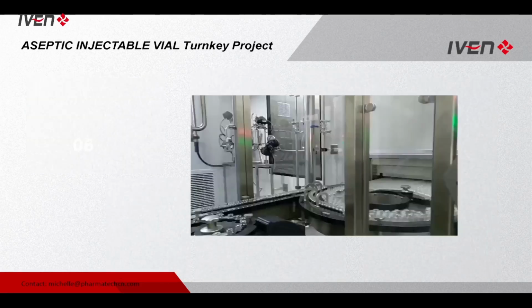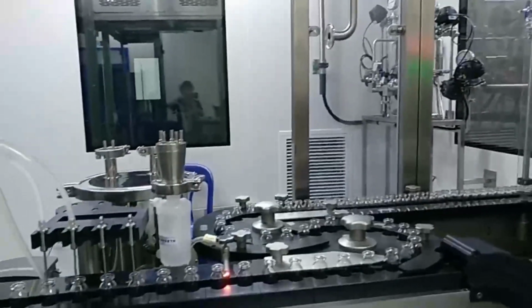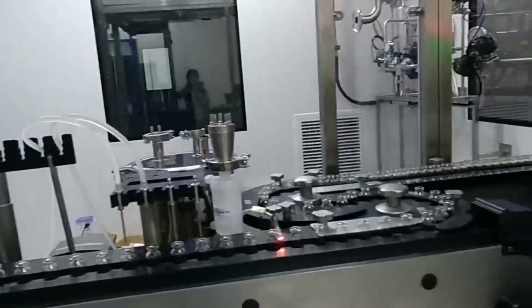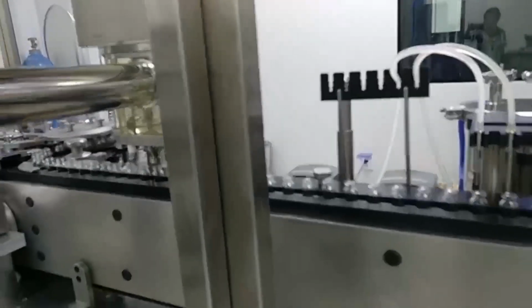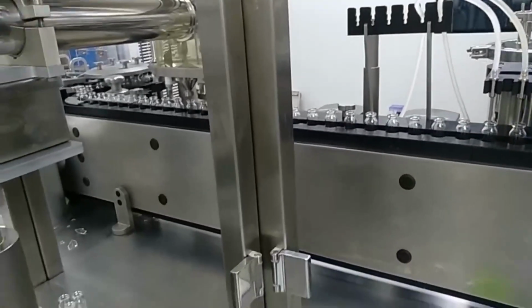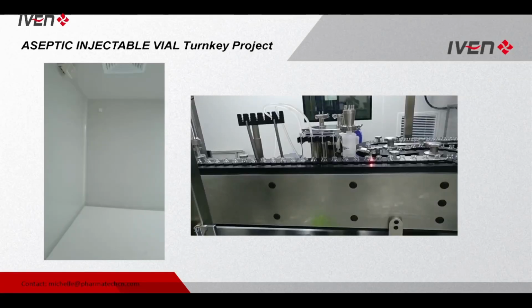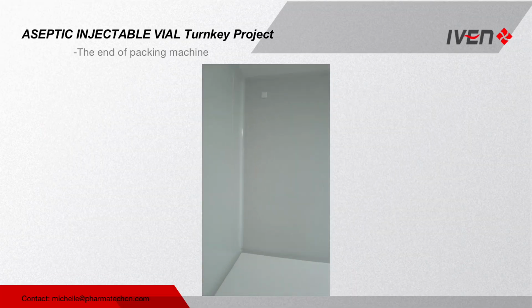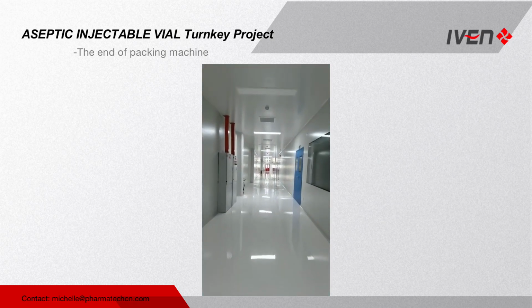Here's a short video at our client site of the injection line environment. It's the final short video to show the clean room system after we finish. You can see the doors; they have different kinds of design.